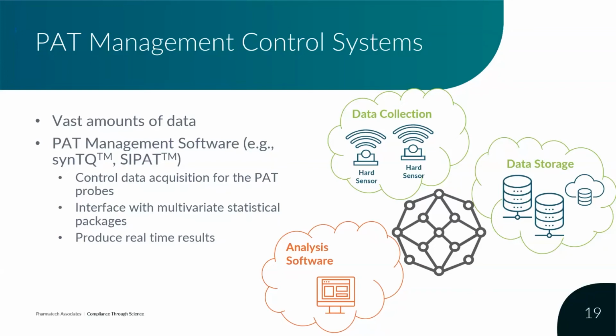And a lot of times, if your control strategy requires data collection every 2 seconds, but the processing time takes 4 seconds, and that's not necessarily unusual, then you're going to need a different PAT tool or probe type. And often this can be discovered way too late, resulting in additional costs.